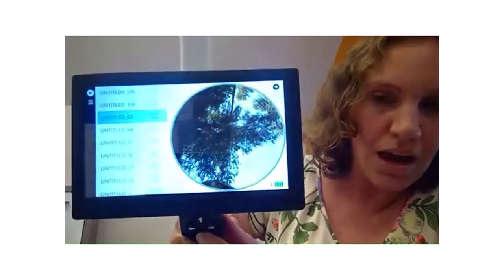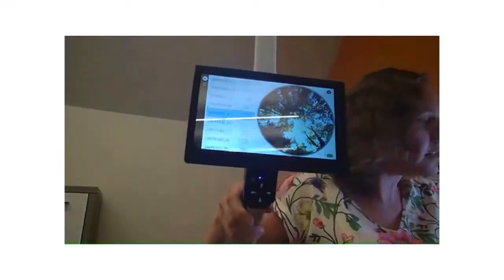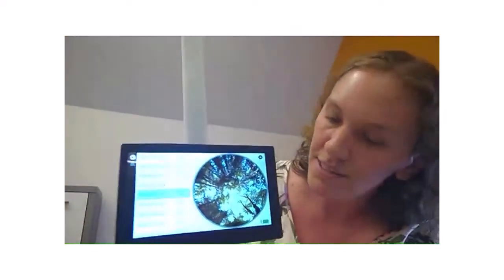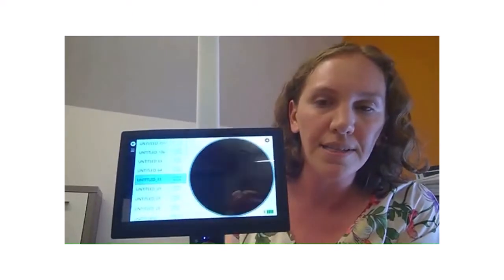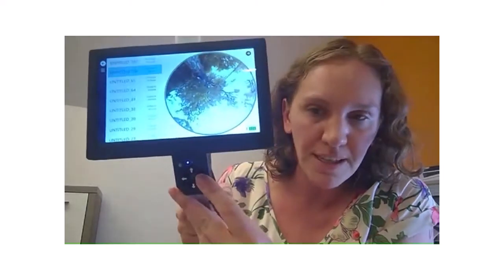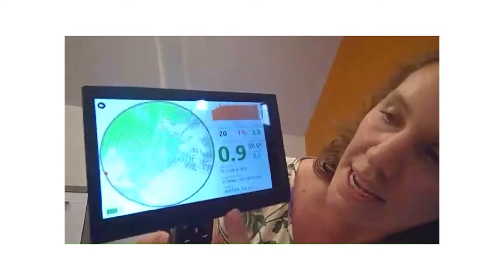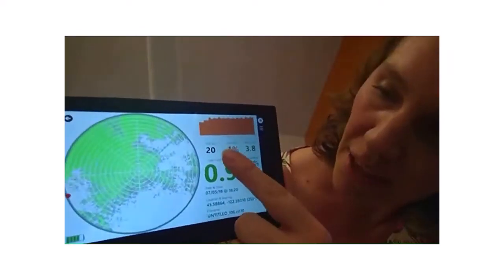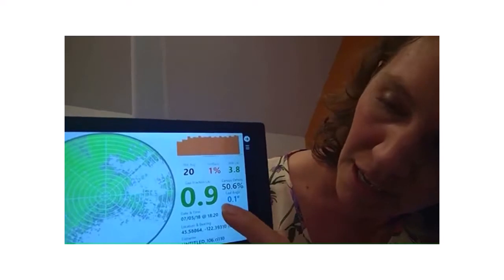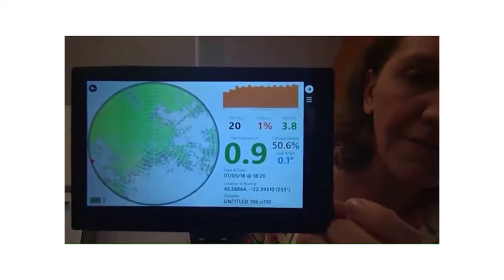This is the data file that you can easily scroll up and down to see the different measurements that you have taken. And you can easily review the different measurements that you've taken by clicking that right arrow to view this data screen that shows you both calculated PAR averages, sunflecks, and PAR LAI, as well as the gap fraction LAI, canopy density, and leaf angle.